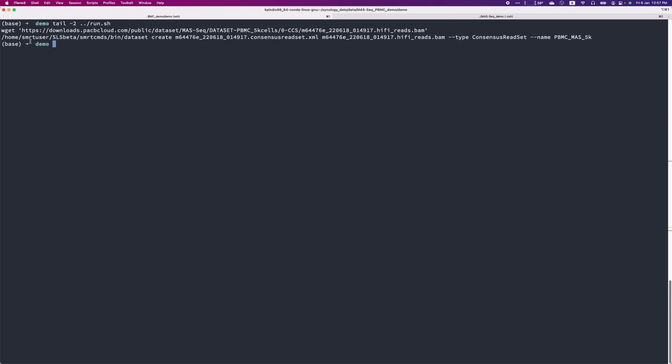As an example, you can use the wget command here to download it using command line.